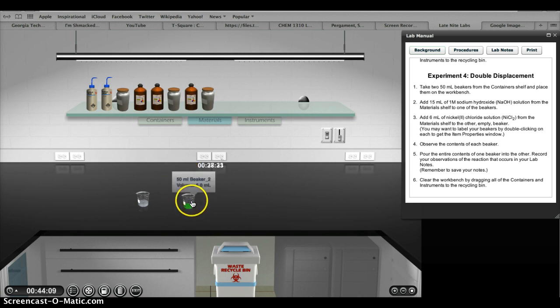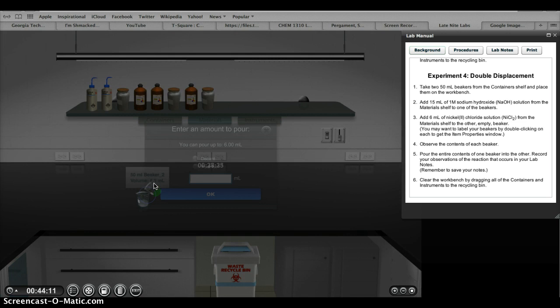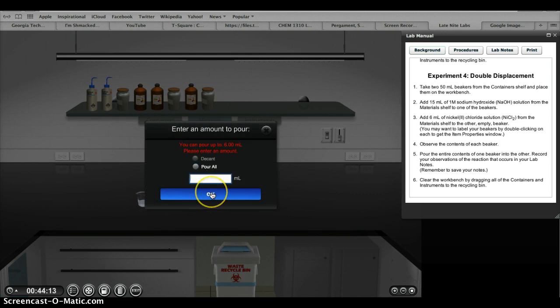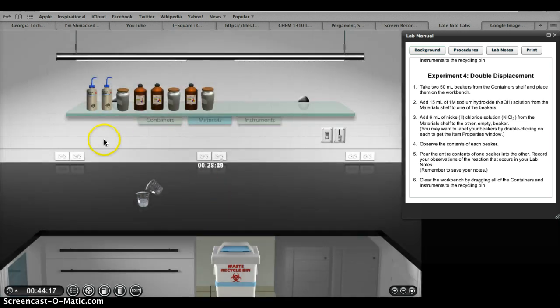So when we mix the two together, the reaction of the two forms a small green precipitate at the bottom, which is the nickel hydroxide, because that is insoluble in water.